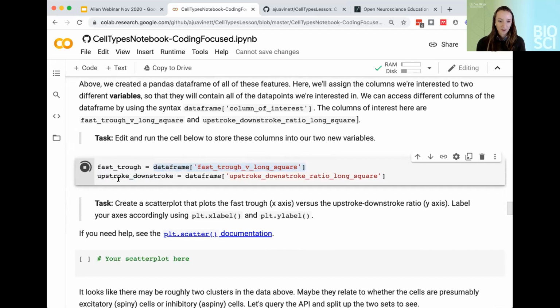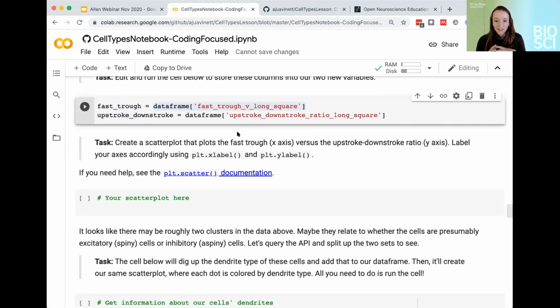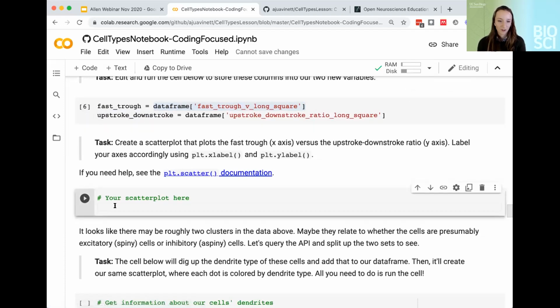And you could run this cell. We didn't add a print statement, so you won't see anything. But when the cell's done running, you'll get a check mark here in the upper right-hand corner. Okay, so let's see actually if these 2 things that we pulled out are actually related in any way. And so this is our first plotting task right now. So we're going to actually use Python to plot a scatter plot where we're just relating these 2 different variables.